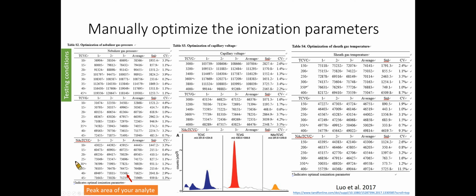By testing different values of a parameter in triplicate, we are supposed to have a bell-shaped distribution in the peak area values, where the optimal parameters were acquired. As these metabolites were detected in different time segments, we were able to assign the optimal parameters for each metabolite. Using this approach, we can find the optimal ionization condition for the best sensitivities of all analytes.